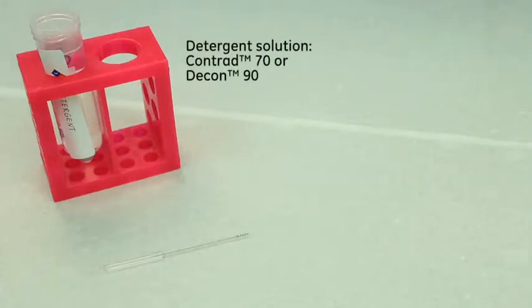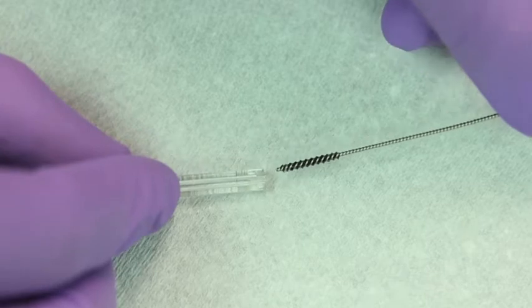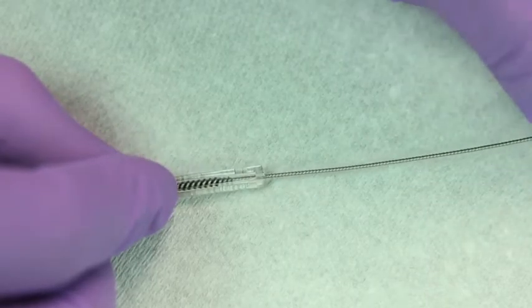To clean the inner diameter of the glass syringe, take the supplied cleaning brush and dip it in our recommended detergent solution and scrub the inner diameter of the glass syringe.